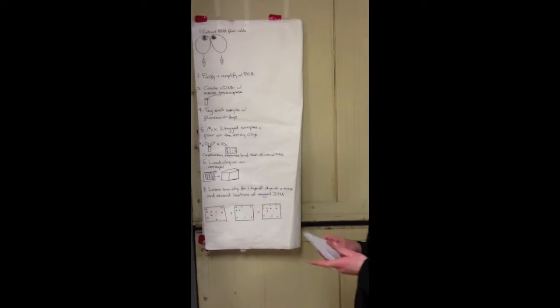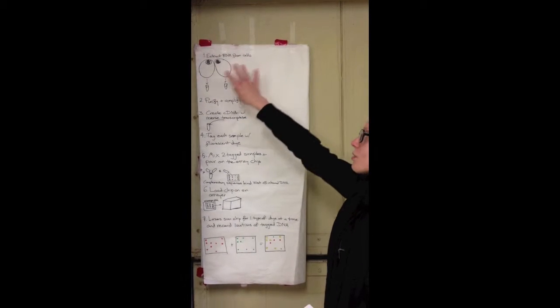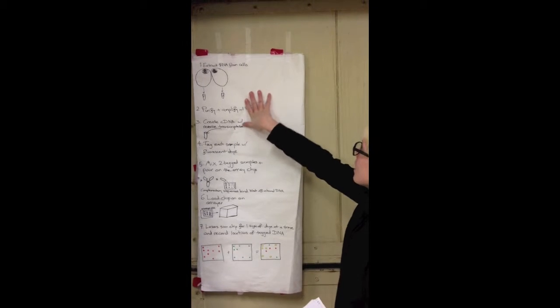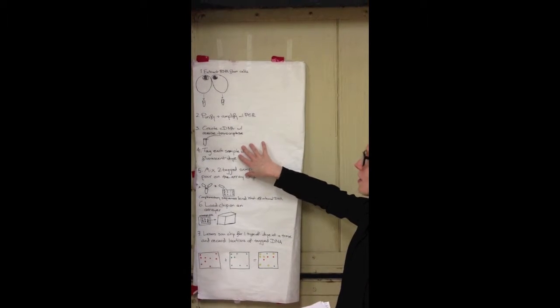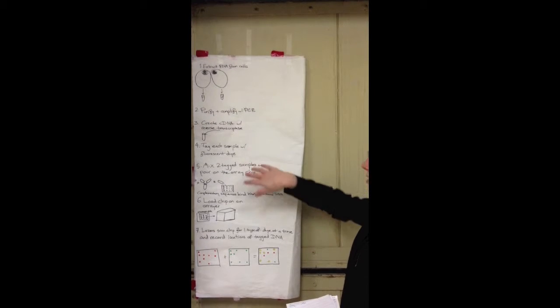This is the procedure for doing a microarray. Your first step is to take your cells of interest. You normally get two different samples, and you extract RNA from them. It has to be purified and amplified with PCR. You make cDNA from that with reverse transcriptase.